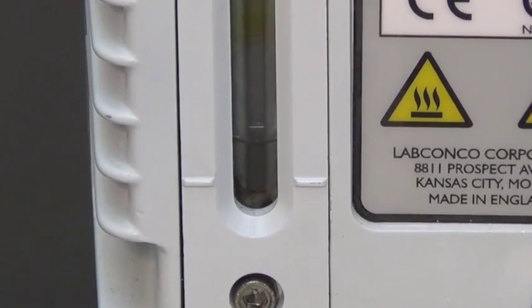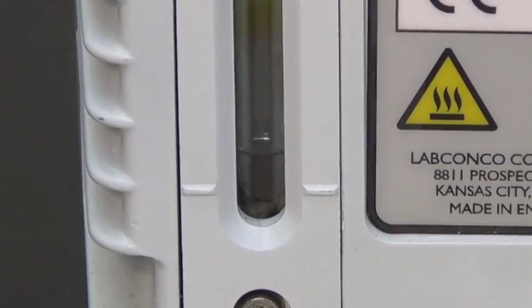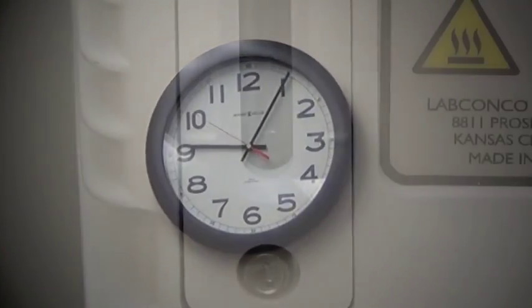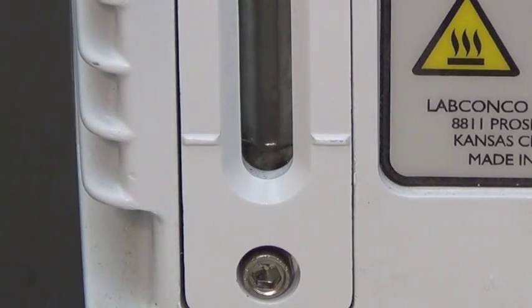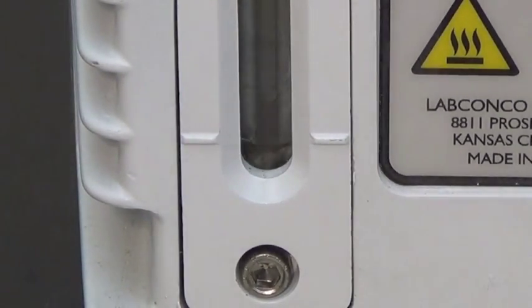The pump will start to drain the old oil. When the sight level glass on the pump indicates that the pump is empty, continue to run the system for several minutes to make sure there is no residual oil in the pump.